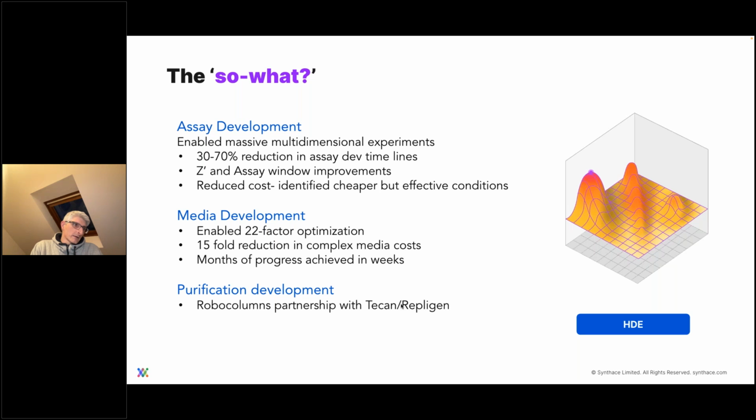When we're looking at purification of biologics or viral vectors, finding the optimal conditions for those purifications is paramount, and finding conditions that are robust and that give us the quality and yield that we need time and time again takes a real investment of effort and time. By having this miniaturized system, we can parallelize more purification runs simultaneously, and so we can get to these answers a lot more effectively.